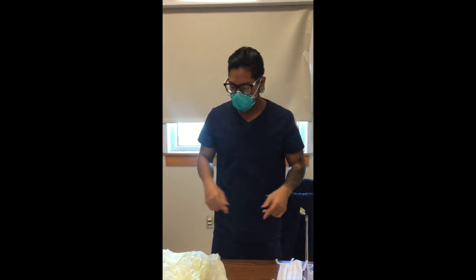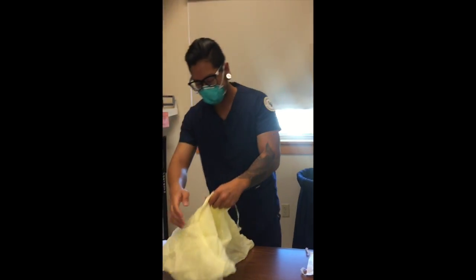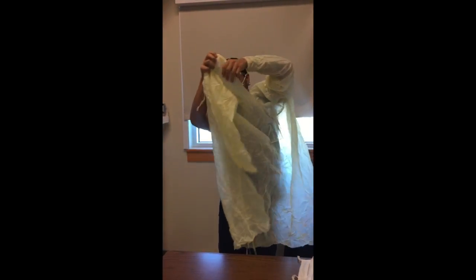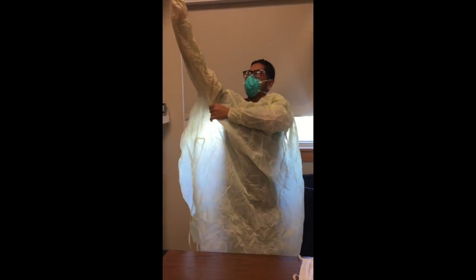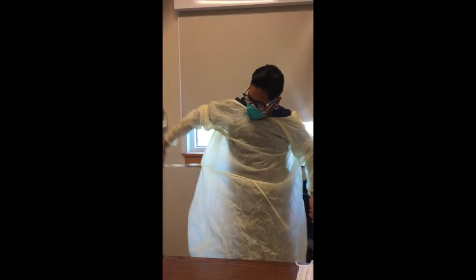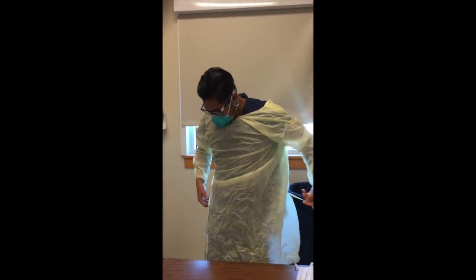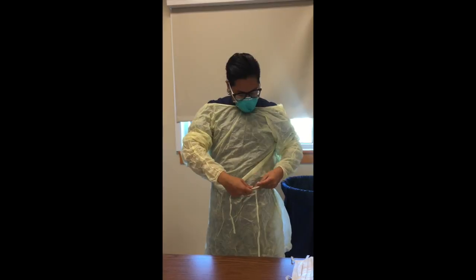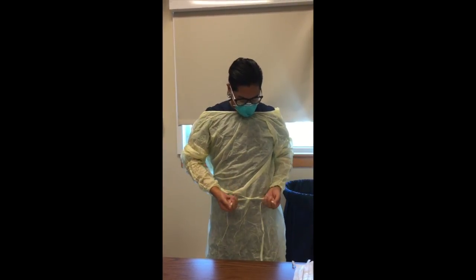And then after, you're going to put on your gown, and you want to make sure that your gown doesn't touch the floor. So just keep it up and high. And then you have this part that goes around you. Okay. And you want to tie it in front so it's easier to take off.